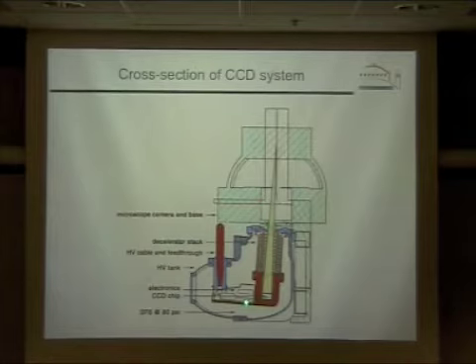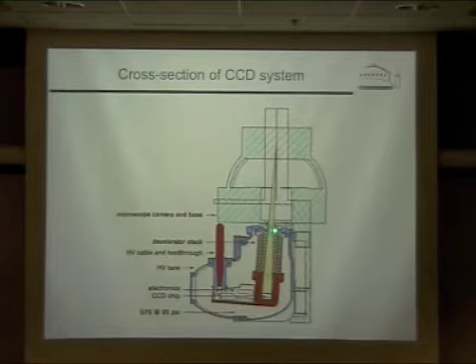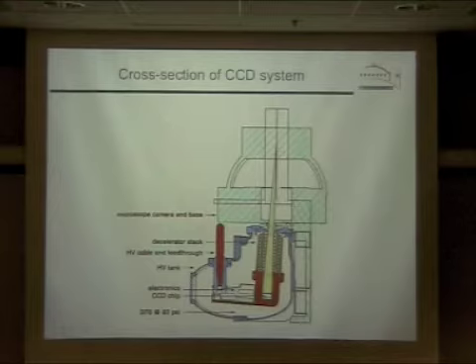And all the stuff in red here is at some high potential, having all this at a voltage that might be 200 or 250 kV negative is what produces this field that slows the electrons down. So essentially, if the electrons enter here with 300 kV, they see a retarding field of 250, they'll hit the scintillator with just 50 kilovolts of energy.